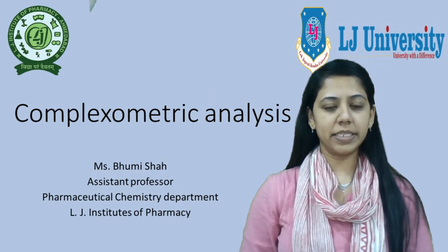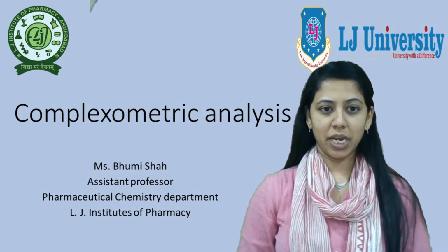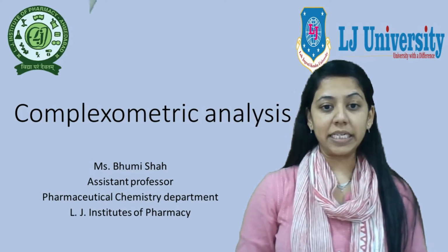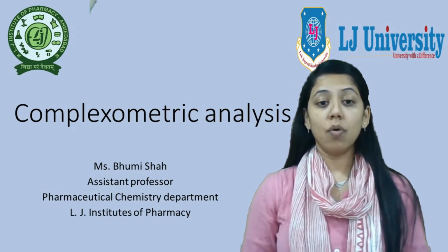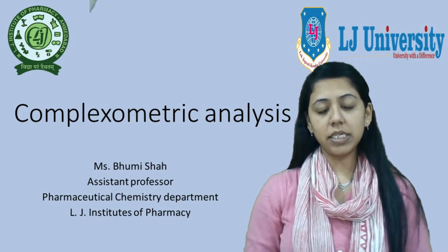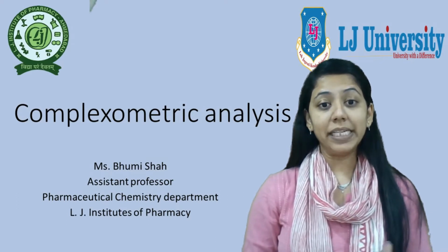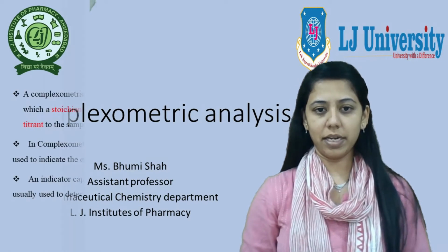Today we will discuss in detail about complexometric titration. In our previous lecture, we had a discussion over chelates, chelating agent, sequesters, sequestering agent, varieties of ligand and all. Now today we will discuss in detail about their ligand, EDTA, or varieties of titrant, indicator and all.